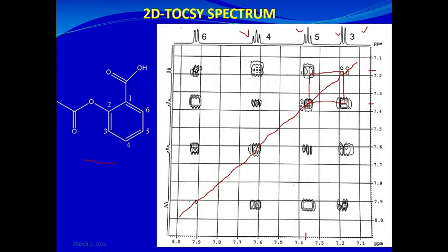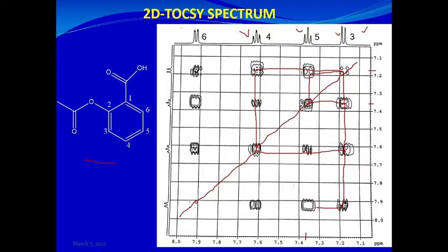But this is not the only correlation that the proton at 7.16 shows. If you extend the correlation further down, you can see it meets another proton resonating at about 7.62, forming another square. Going down further still, you meet another proton resonating at about 7.92. So the proton at 7.16, labeled as H3, shows correlation with the proton at 7.35, labeled as H5 — this is a long-range coupling.